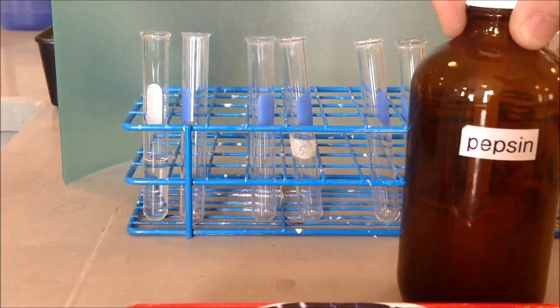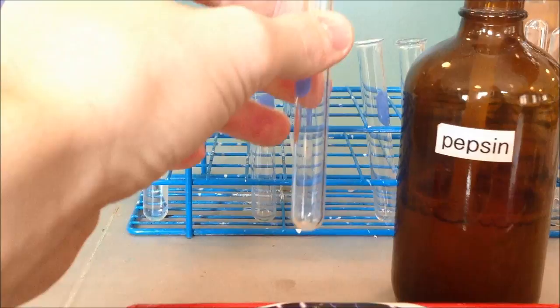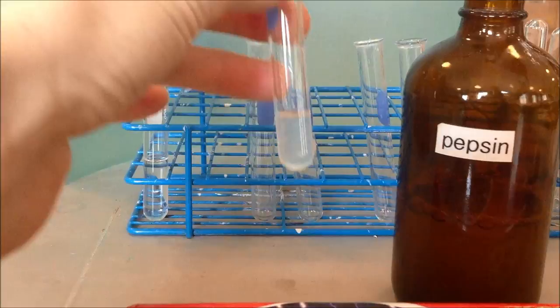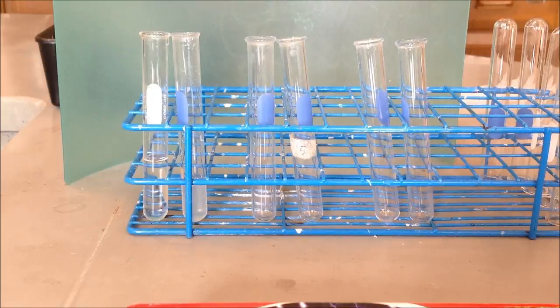We're going to put the pepsin into this test tube. To test for the presence of protein, we're going to use an indicator called biuret. We'll take some biuret and add it to both the water and to the pepsin. Water has no protein in it, so that's our negative. The pepsin has protein in it, which is our positive.